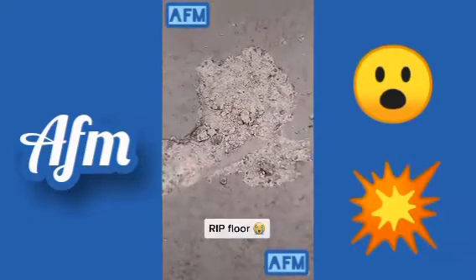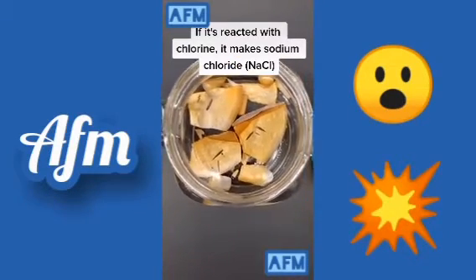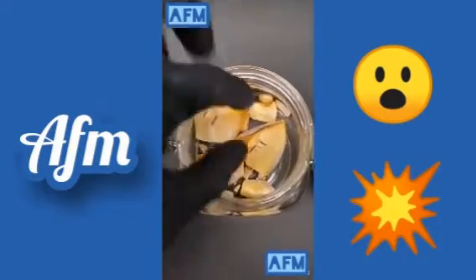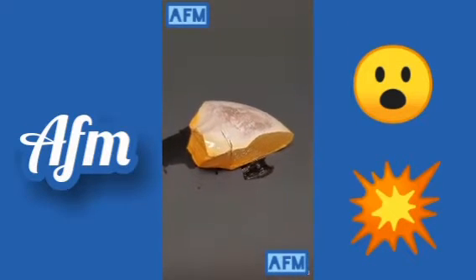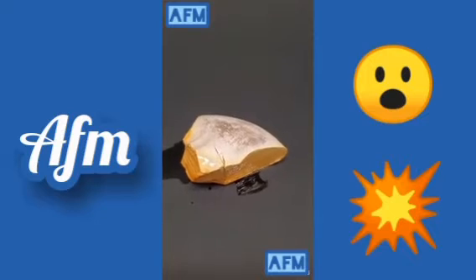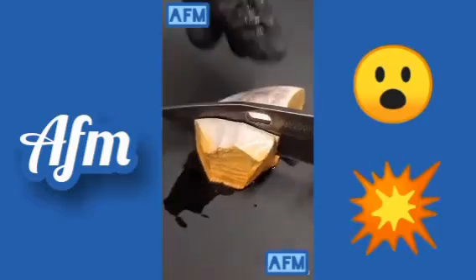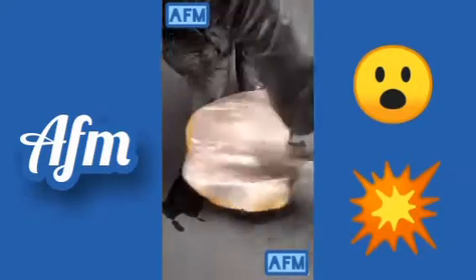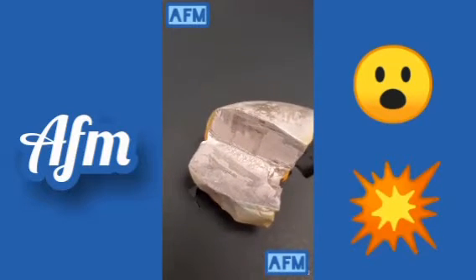This is sodium metal. It's stored under oil because it's very reactive to moisture and air. Most metals are hard, but sodium metal is really soft, and you can squish it just with your fingers if you squeeze really hard. Metals are usually shiny, and sodium metal is as well, but because it's so reactive, it quickly tarnishes. But because it's so soft, it can be easily cut with a knife, and on the inside, we can see the nice and shiny metal. After only like 10 seconds, it's already tarnished.